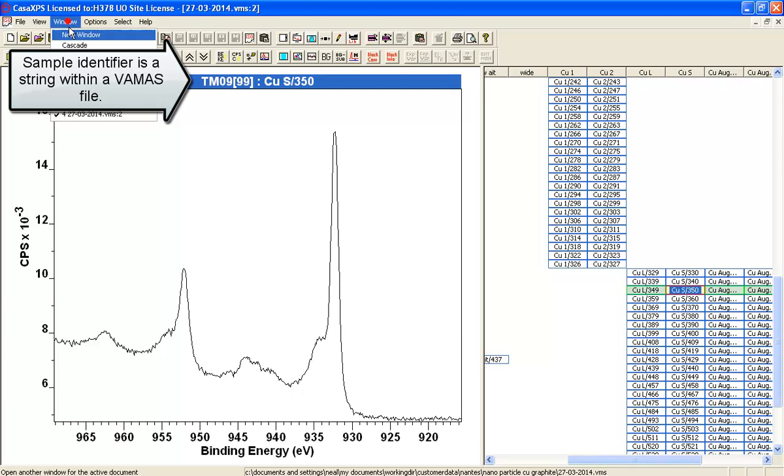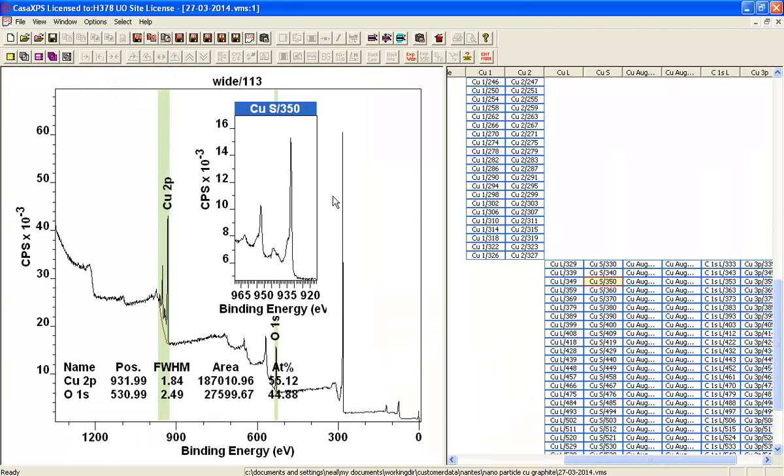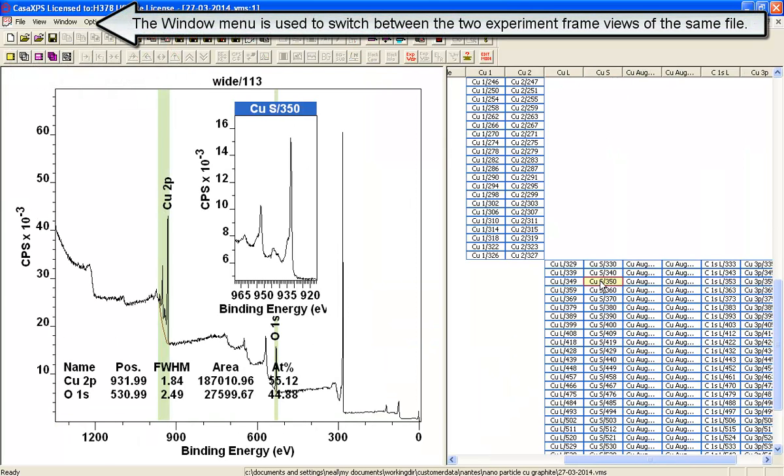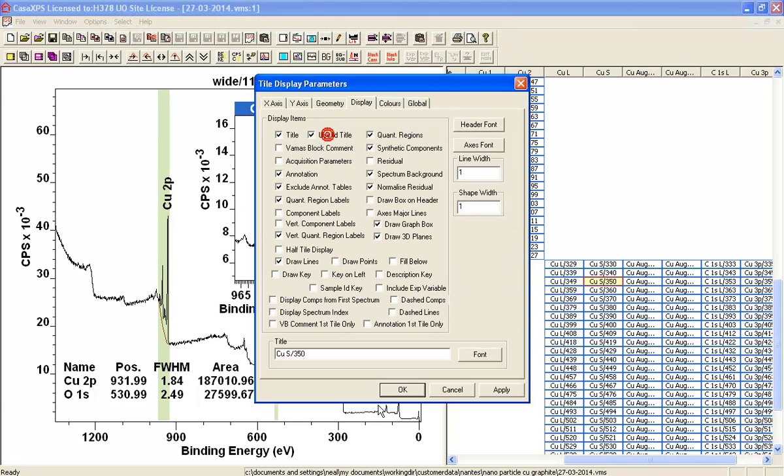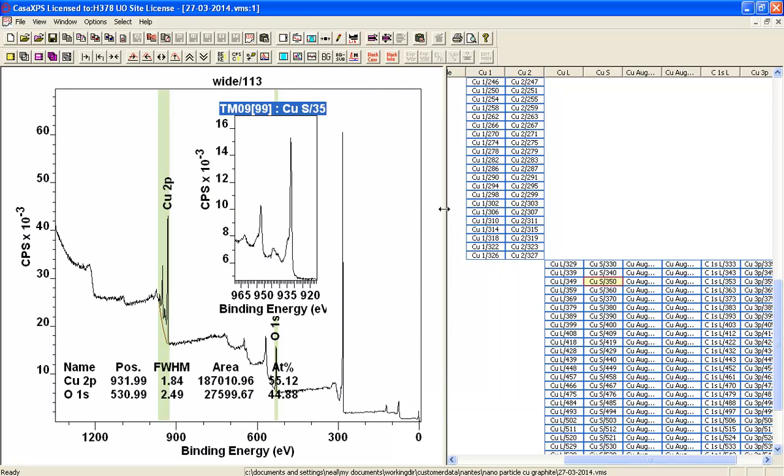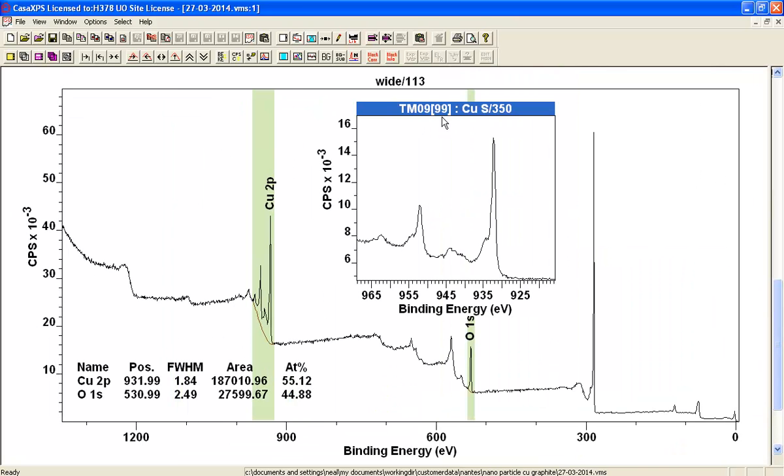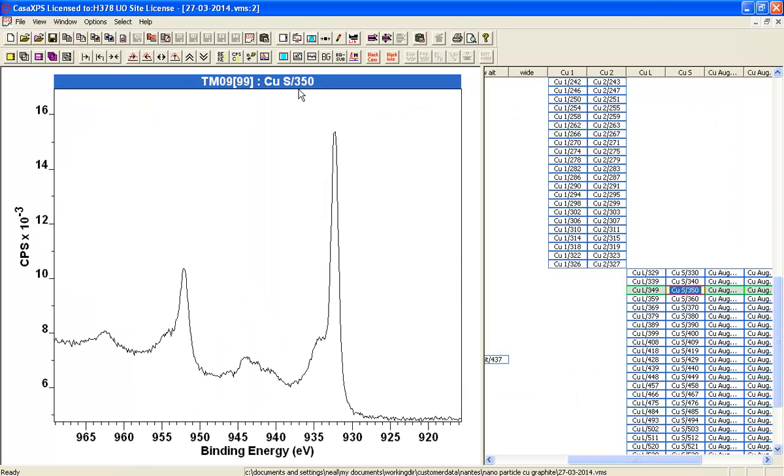Let me just go back to the original display, and we can see here that I'll put the identifier on here again and pull it out so we can see it. Yes, that's the one that we're interested in. So back to the second view of this data file.